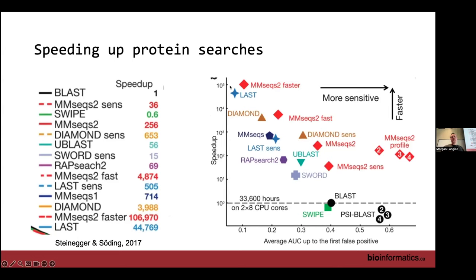If you're interested in literally calculating diversity metrics on these, which hurts my brain to this day, you can do that, where you would calculate alpha diversity of a particular function across samples. You can also calculate beta diversity of how the taxa contribute to a function and look at that across the diversity of the actual function. So you can do alpha diversity and beta diversity on functions. We did that, or we will do it. Did we do that? It doesn't matter.